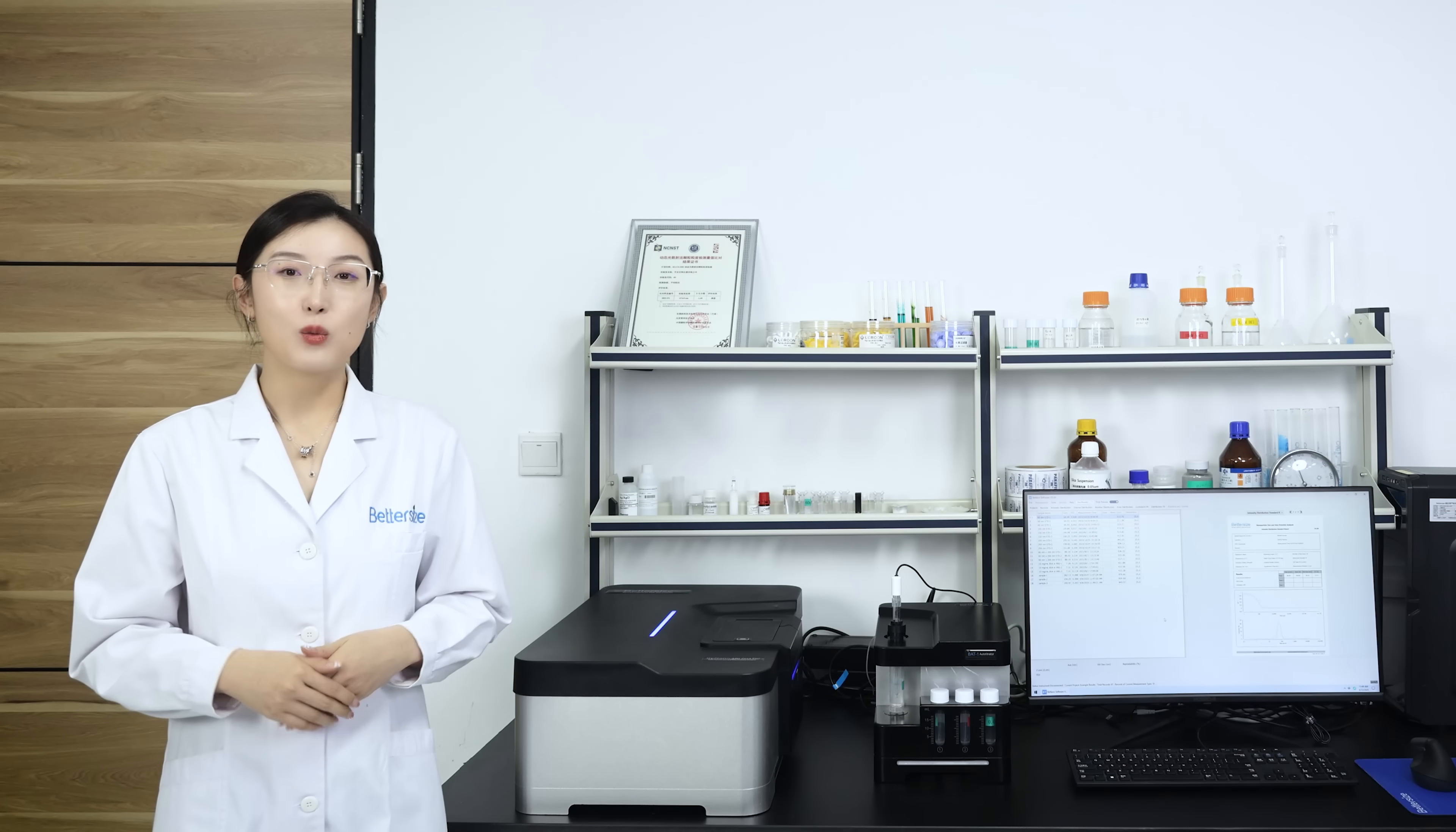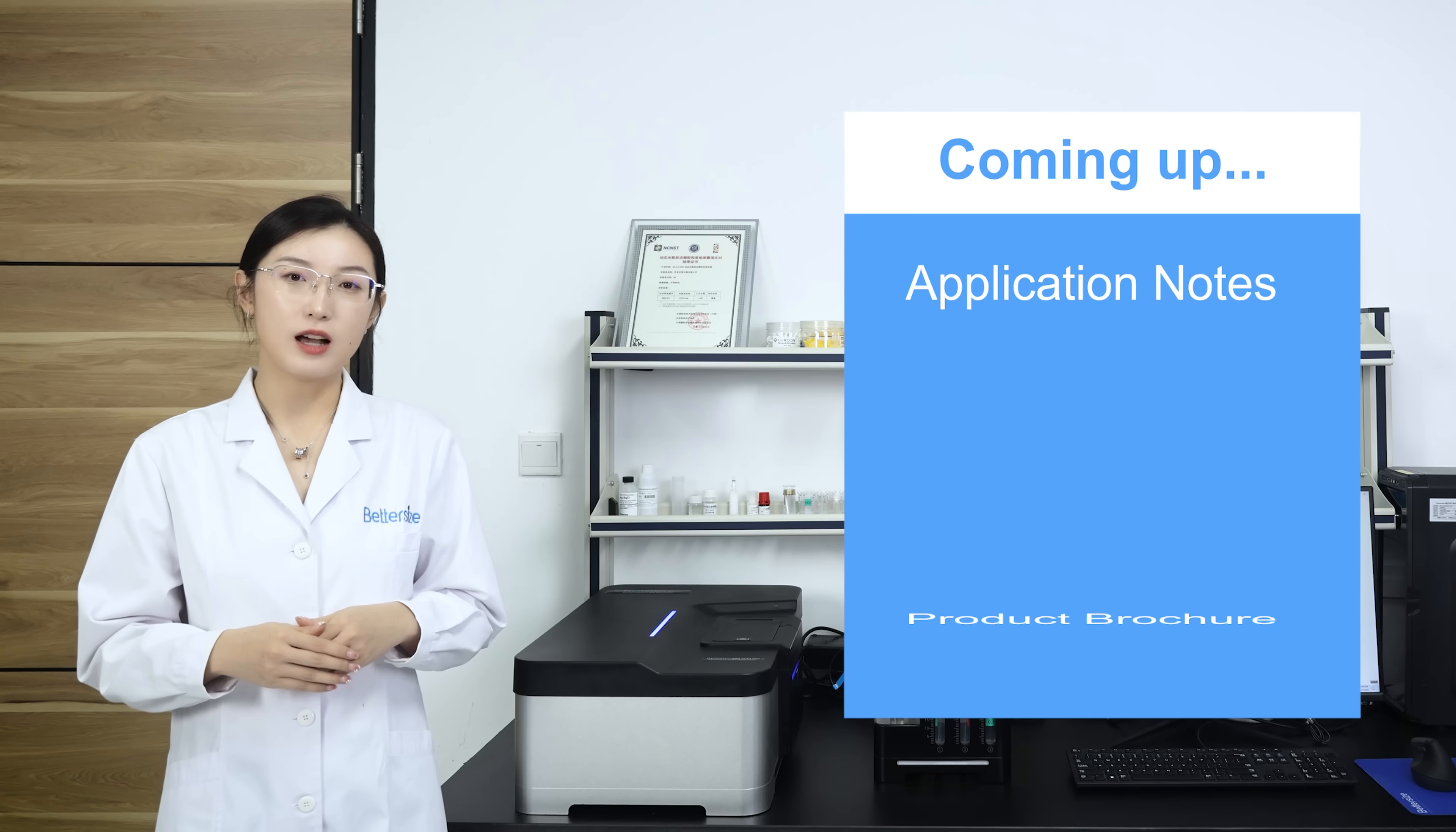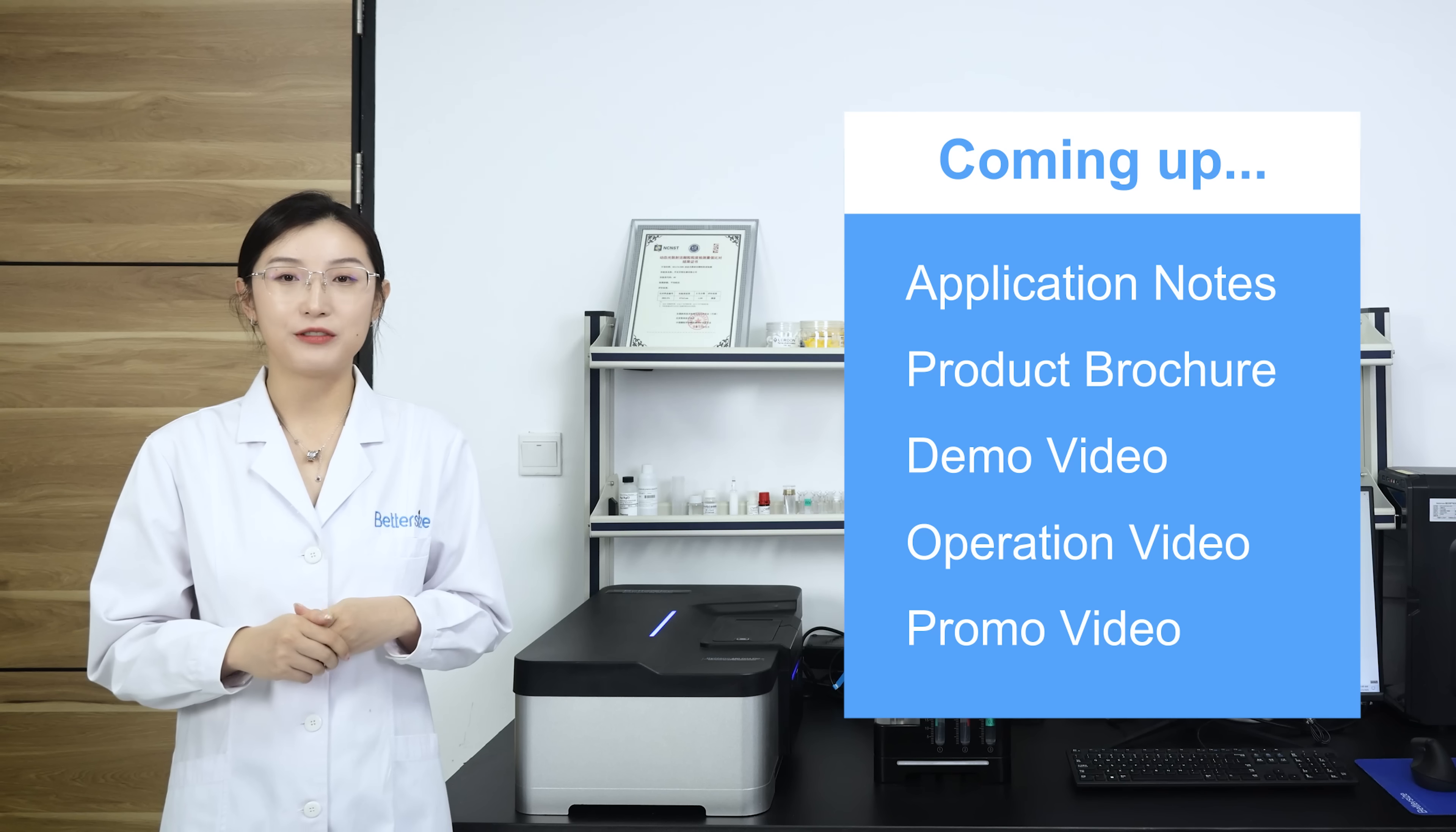In the coming weeks, we'll release a series of resources, including six application notes, a product brochure, a demo video, an operation video, and a promo video.